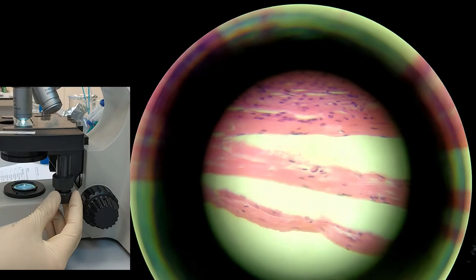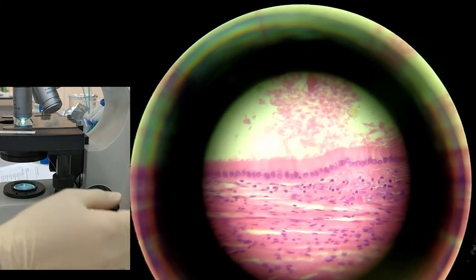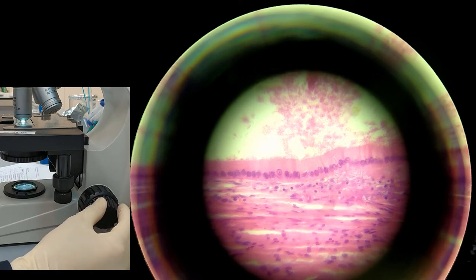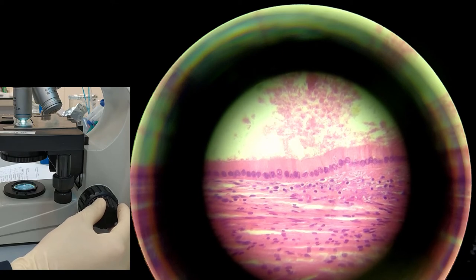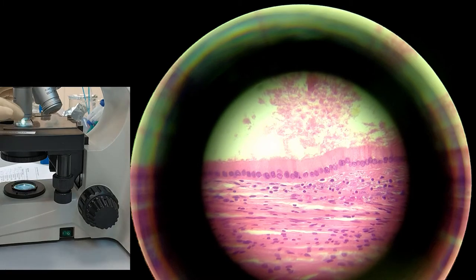Find the best view and draw it. As you can see here, these cells look like columns. That's why this is the simple columnar epithelial tissue.